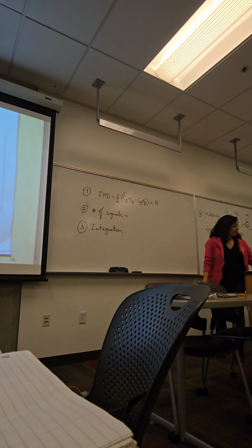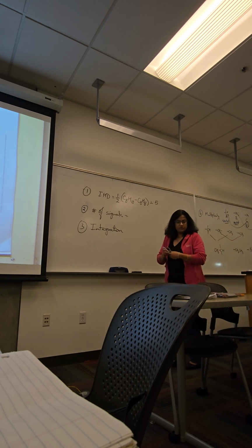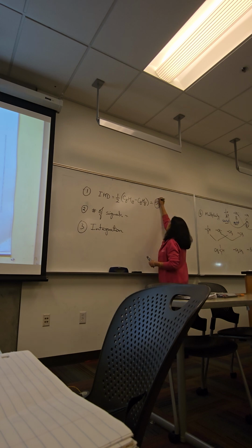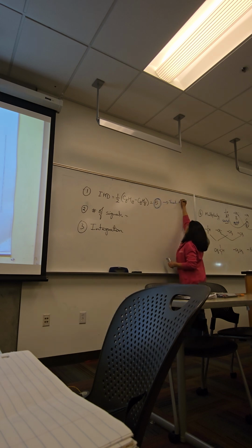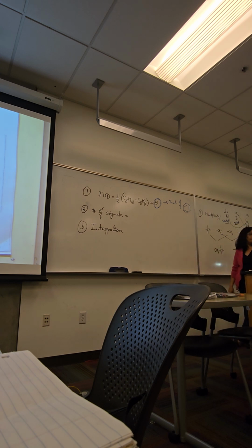Hint number 1. Whenever you see IHD equal to 4 or higher, think of a benzene ring. How many IHDs does a benzene ring account for?